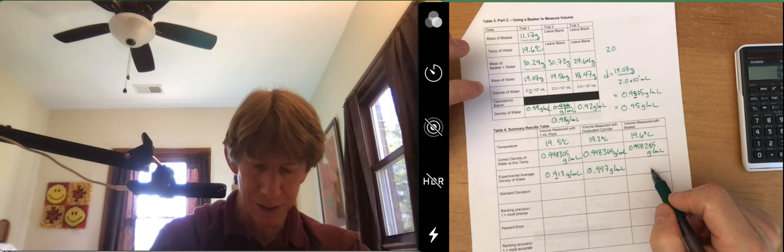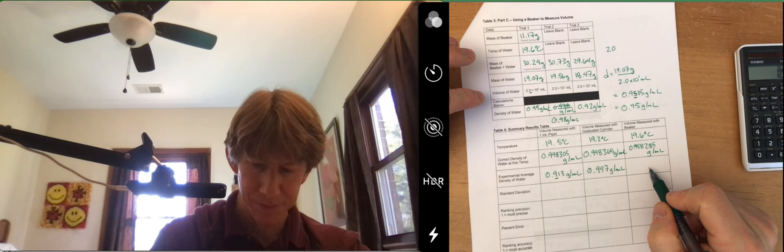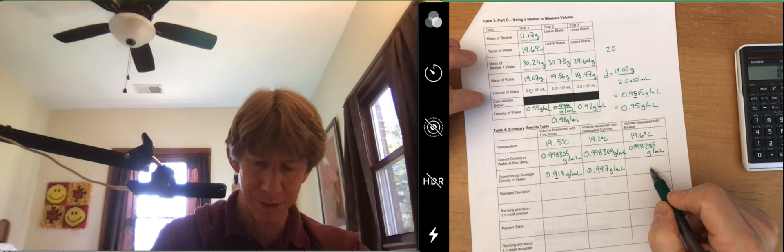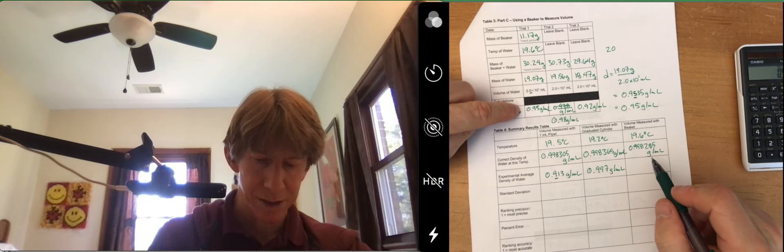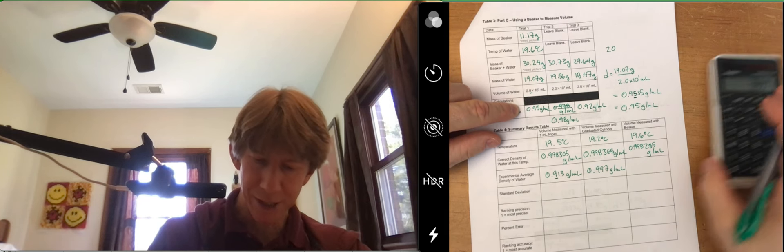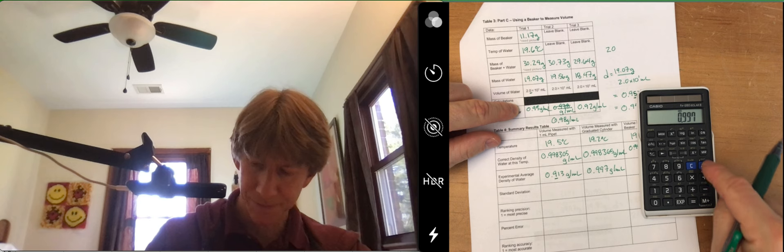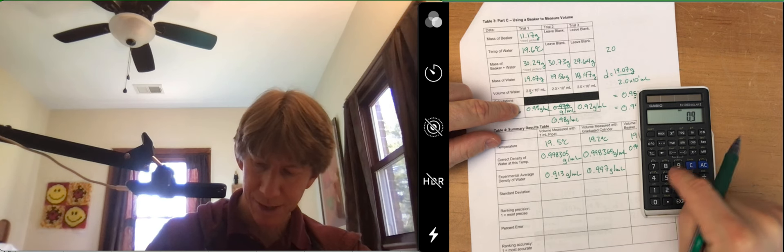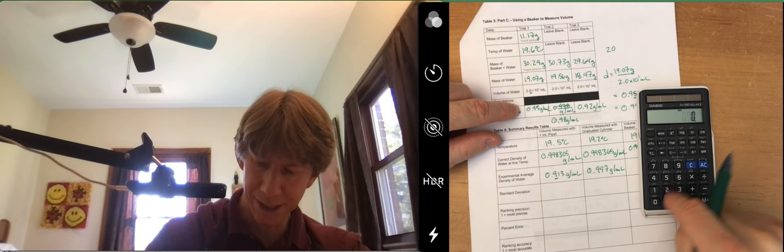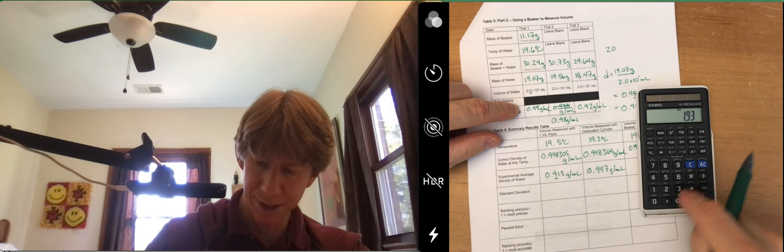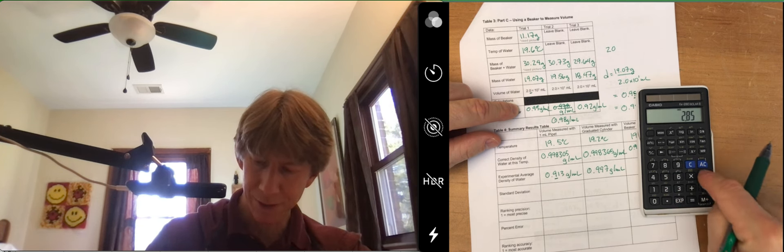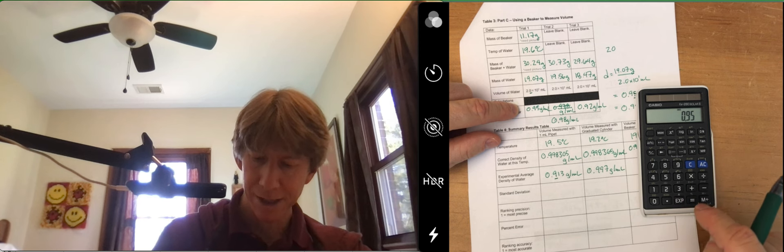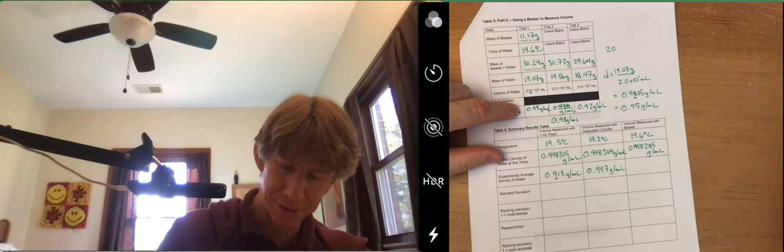Now, volume measured with beaker, 0.95 plus 0.98 plus 0.92 divided by three, 0.95.